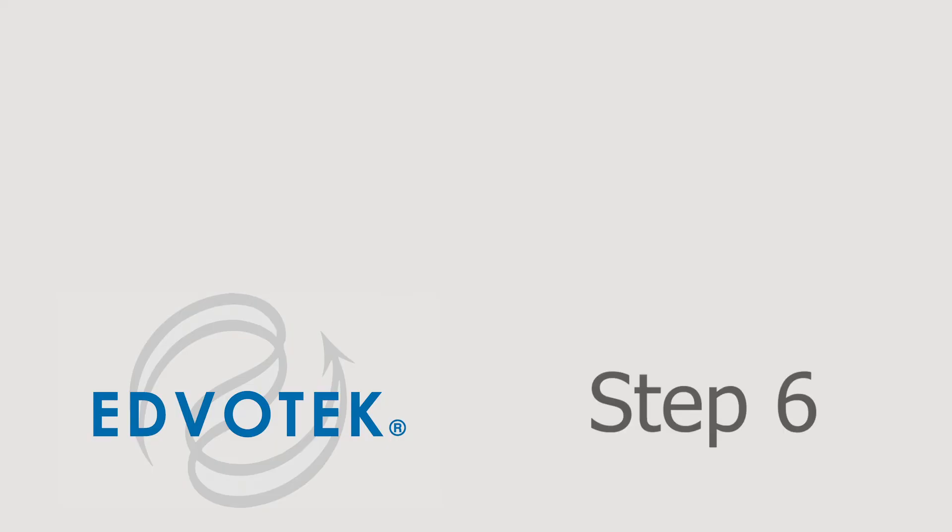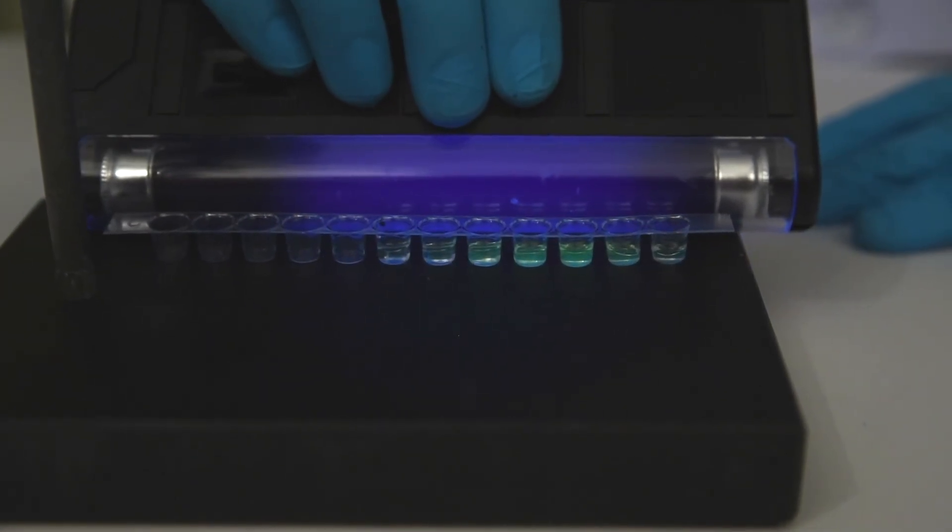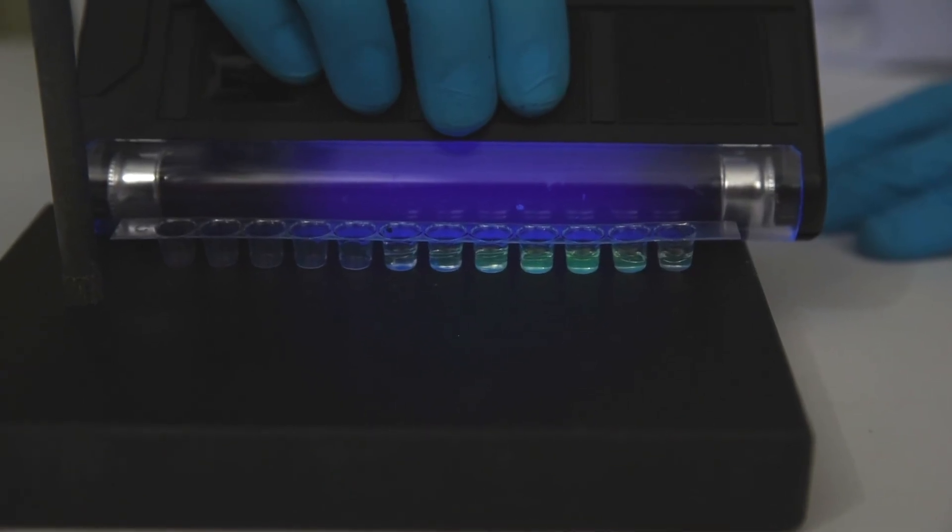Step 6: Check the fractions in the microtiter plate by using the long-wave UV light. Identify the well that contains the brightest levels of fluorescent proteins.